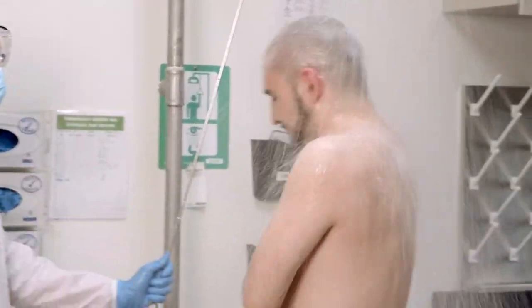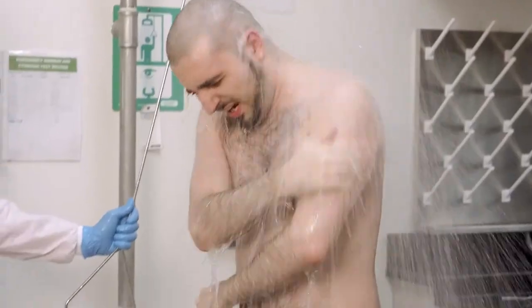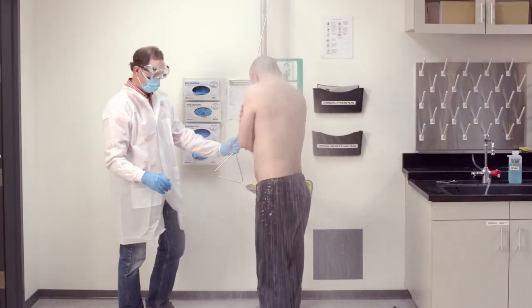Now is not the time for modesty. You will want to remove all the hazardous material from your body. Have someone check the SDS to determine if any further action is required based on the chemical or hazardous material. Ensure that security documents the incident with an incident report afterward.